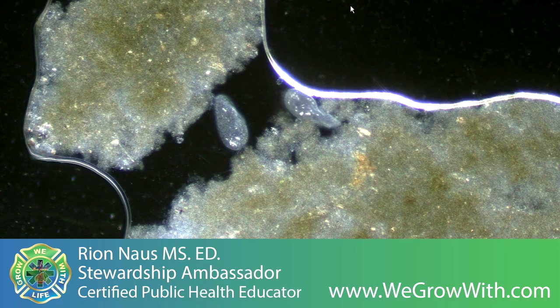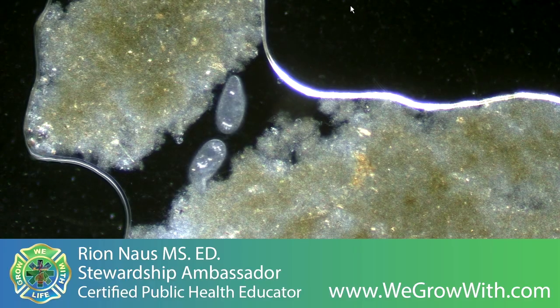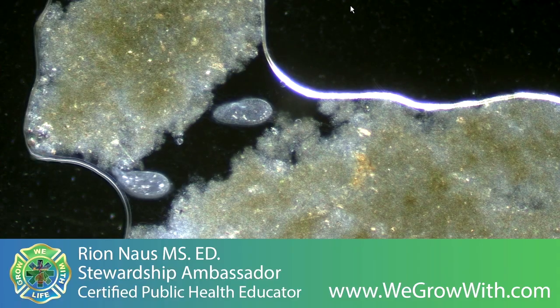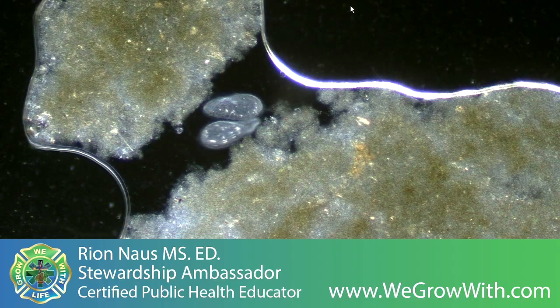Oh, that film layer is so thin that the other one can't get past it. So now we're talking about the thickness. You see how it bulbs out? Oh, it had to make room. I think that one's at a place of the inevitable. I think we have some cyst transition.